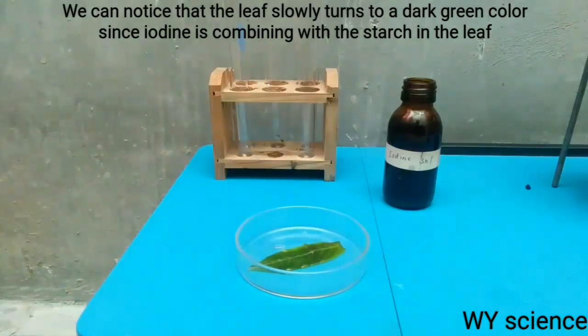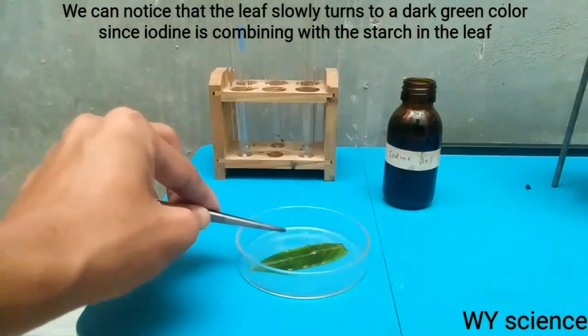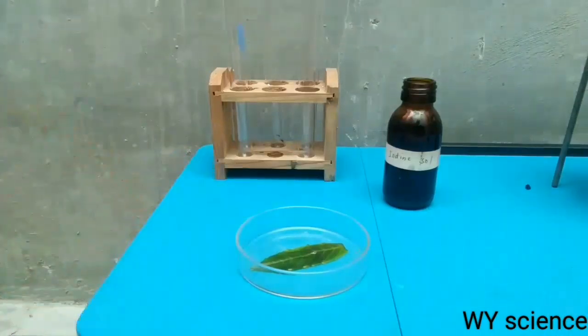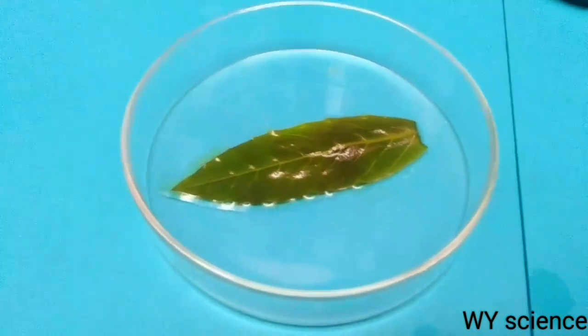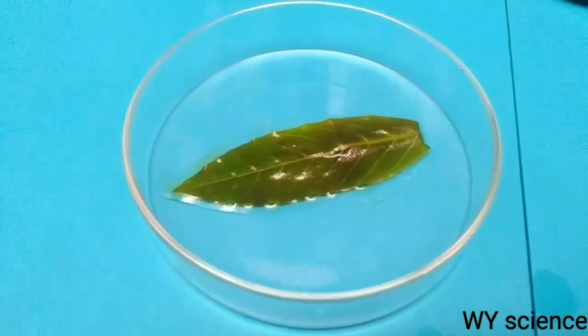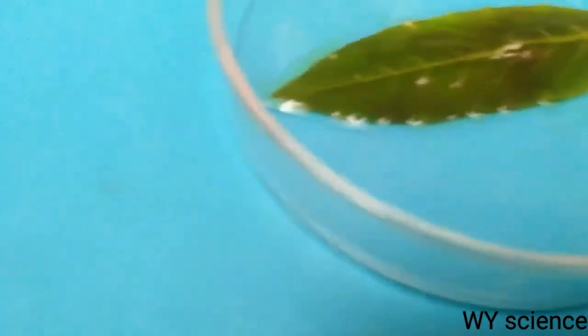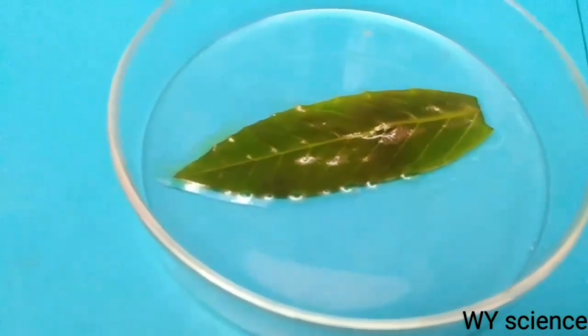We can see that the leaf is slowly turning to a dark green color. This is because iodine is mixing with the starch present in the leaf, which gives the leaf a violet complex. This experiment proves that starch is really present in leaves. Here we can clearly see how the leaf changed color from a light green color before the experiment to a dark green color, with some parts even turning violet due to the combination of starch and iodine.